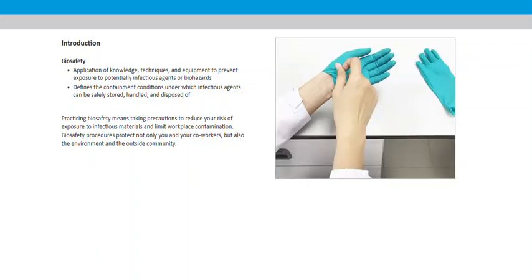Practicing biosafety means taking precautions to reduce your risk of exposure to infectious materials and limit workplace contamination. Biosafety procedures protect not only you and your co-workers, but also the environment and the outside community.